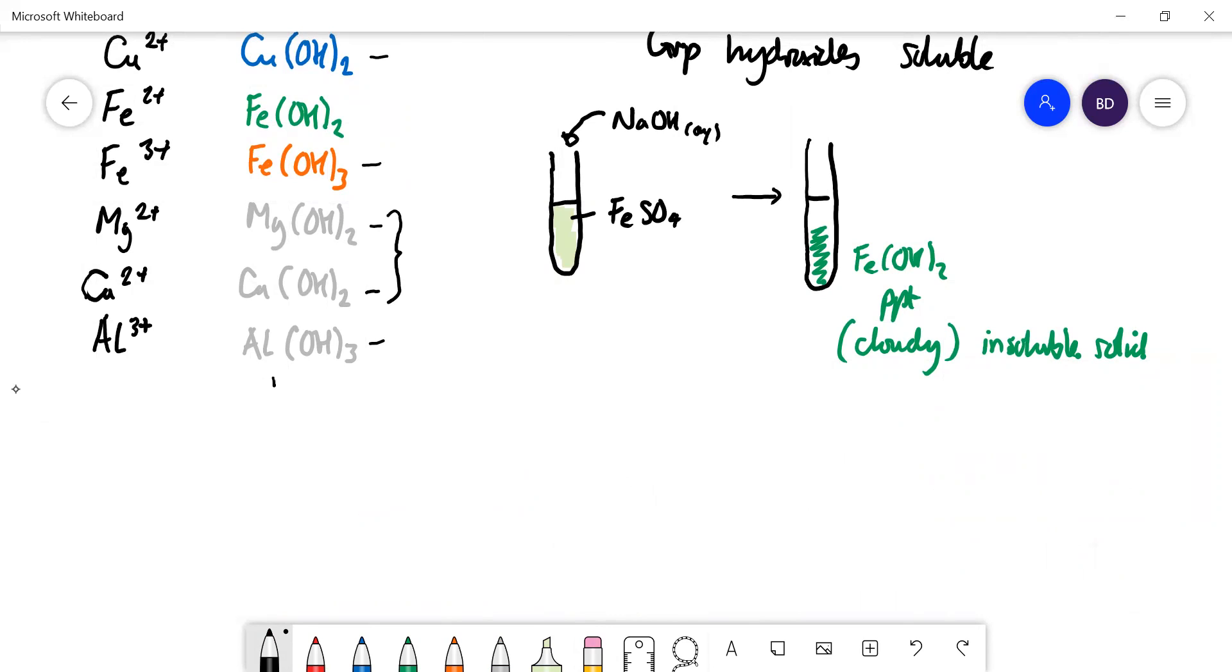You first add a little bit of NaOH and you get a white precipitate of Al(OH)3. Then you add excess NaOH, and the white precipitate dissolves. Aluminium is really easy to spot - it will go clear again, clear and colorless, when you add extra sodium hydroxide.